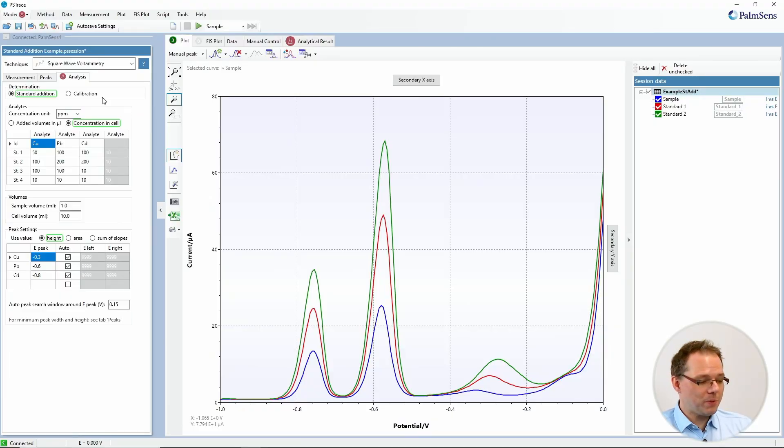The nice thing is, if there is something in that sample — like in this river water — that influences the sensitivity of the measurement of that metal ion, it influences that for all the steps of the measurement. So standard addition is very popular when you're not sure if your sample medium influences your sensitivity. That's the choice between calibration and standard addition.